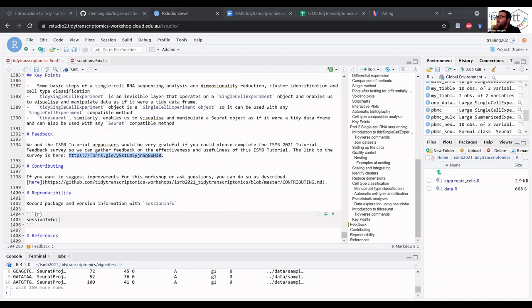Usually, the bigger the information content of a dataset, a huge dataset might need many more principal components to be described. For example, UMAP and clustering, most of them are based on principal components. They don't work directly on the transcriptomic data. So there are functions to identify the optimal number. Now I don't remember the function, but if you Google it, you will find plenty of documentation.